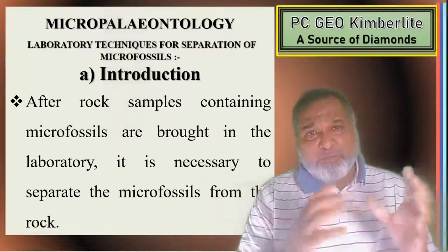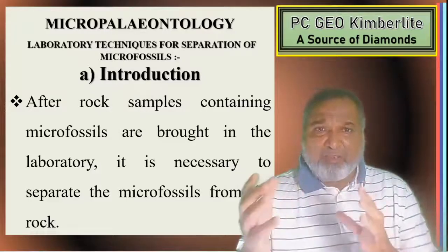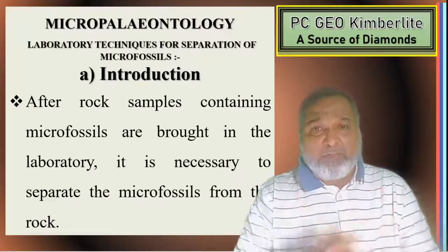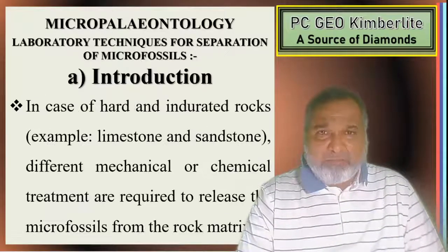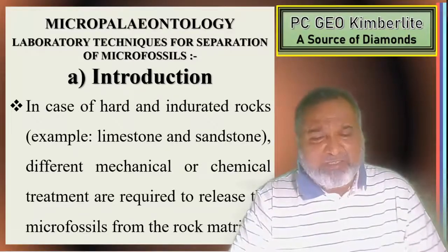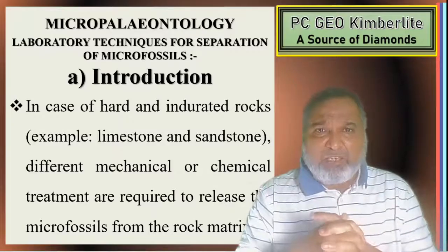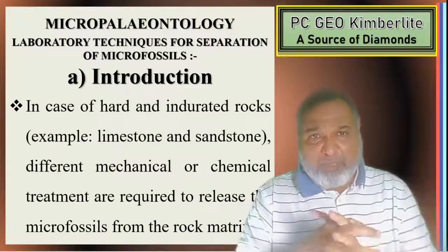So that sample has been brought from the field. Now, once it is brought into the laboratory, it is necessary to separate the microfossils from the rock. We could not see them with our own eyes because they are very fine in size. So now we have to give some treatment for the separation of microfossils.